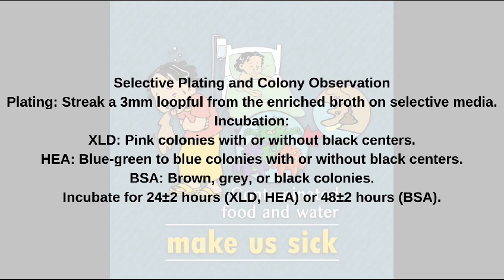After which we have to do selective media plating. In this step, we will be using selective media such as XLD, HEA, and BSA agars to isolate Salmonella species which might be present in your food sample or water sample. What we need to do is streak a loopful of the incubated broth on the selective agar plates such as XLD, HEA and BSA.